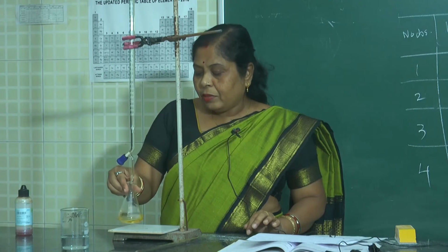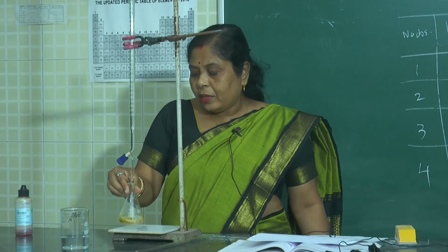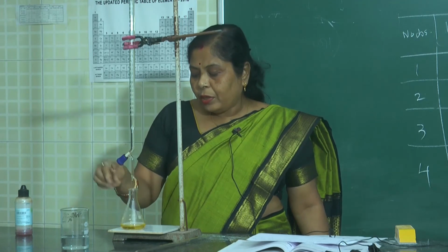Always do the titration with a single hand. Now you see the color has changed from light pink to straw yellow.